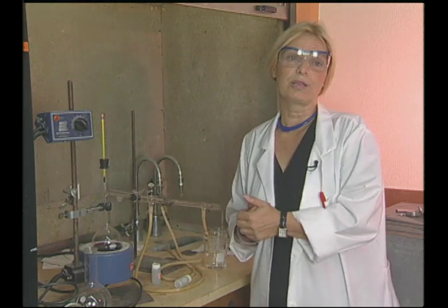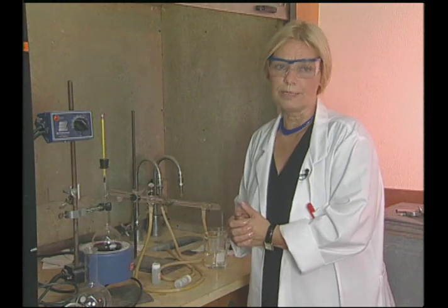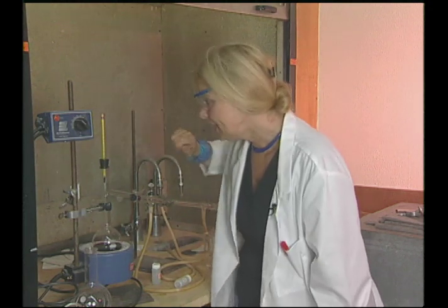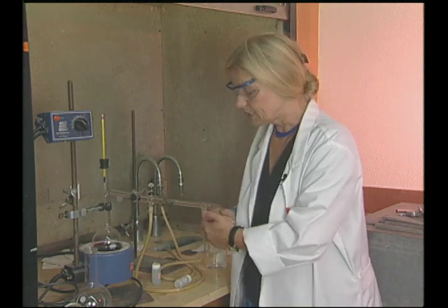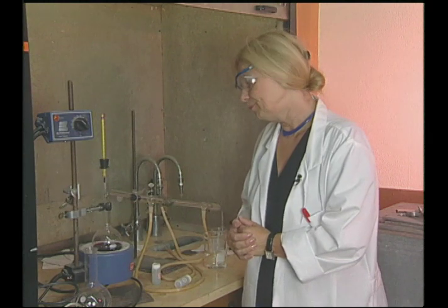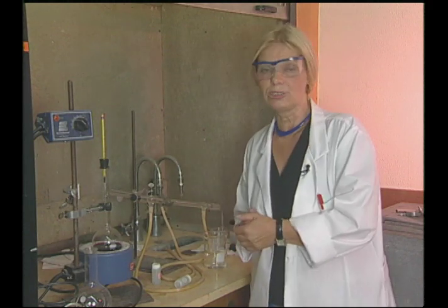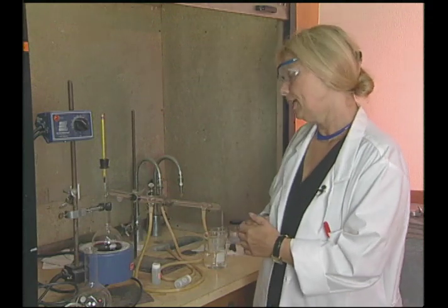So I could even get a cup of coffee in the meantime because the condensation will be at a steady state. So now the temperature is 45 degrees centigrade, and we have a little ways to go. We will start noticing that the mixture here in the distilling flask will start bubbling and boiling, and we will see condensation building up. So that'll be very interesting to observe later on.